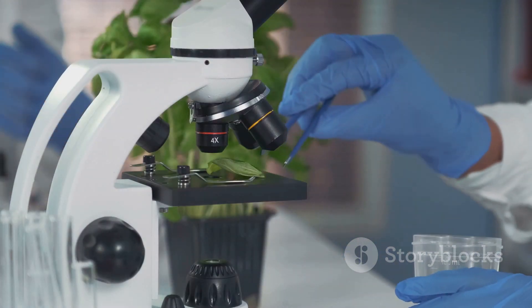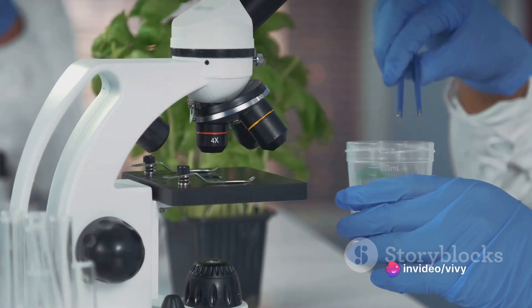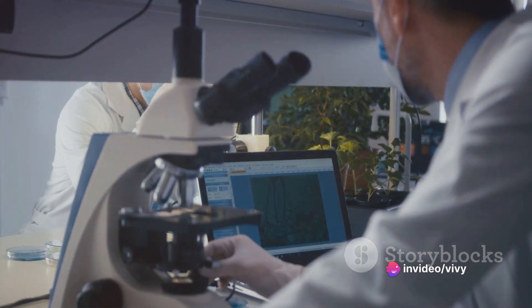Next, place the thin section of plant tissue onto the glass slide. Utilize the tweezers for this process to maintain sterility and precision.